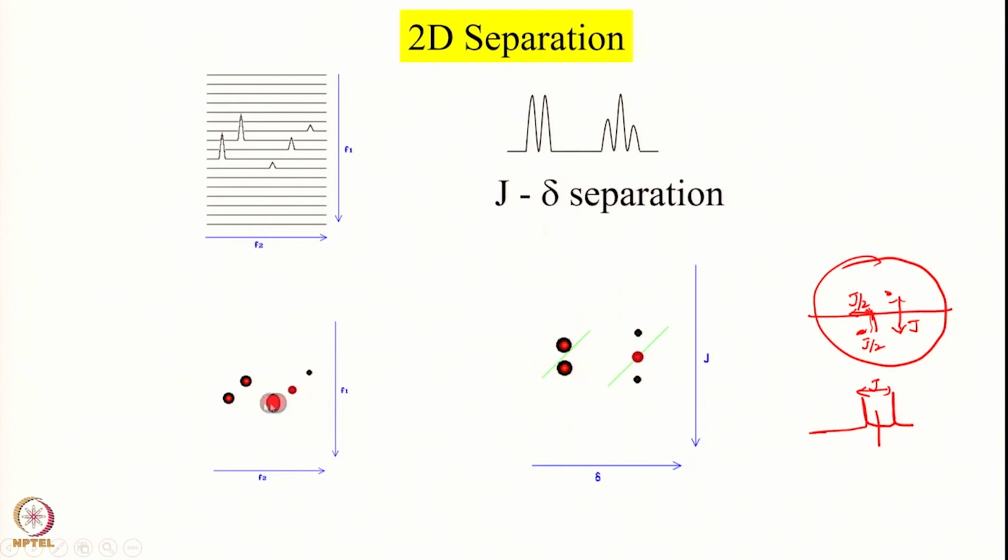One of them is moved this way, the other this way, and this one again is moved this way and that way. Let me indicate that here. When you move these, they all come onto the same line. As a result I will have this spectrum.